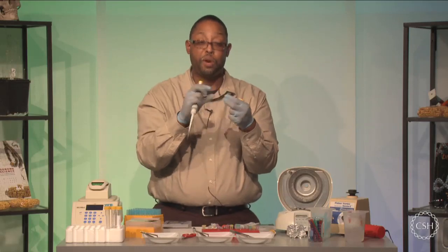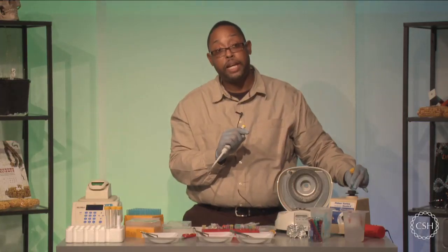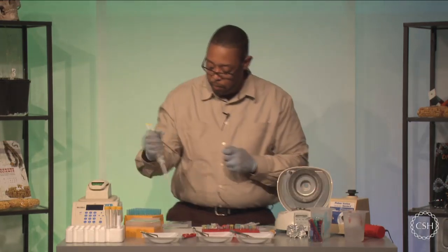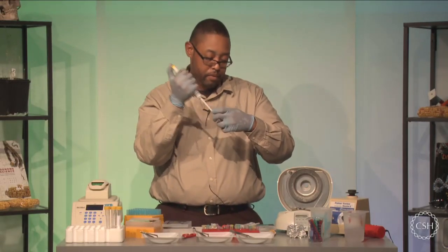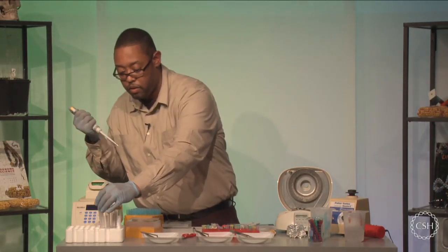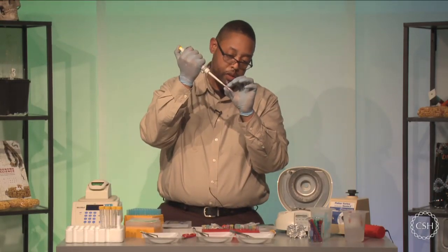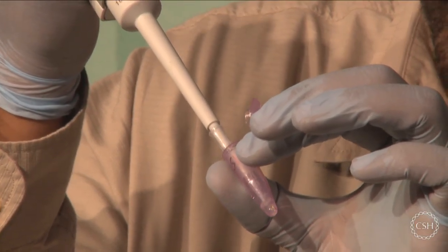And just want to make sure it's thoroughly mixed. So you can either finger vortex or vortex on the machine once again, and then place that back in your rack. And we'll continue to do that for everything. So we'll finish out that way. So we're just going to make sure everything gets broken up here.